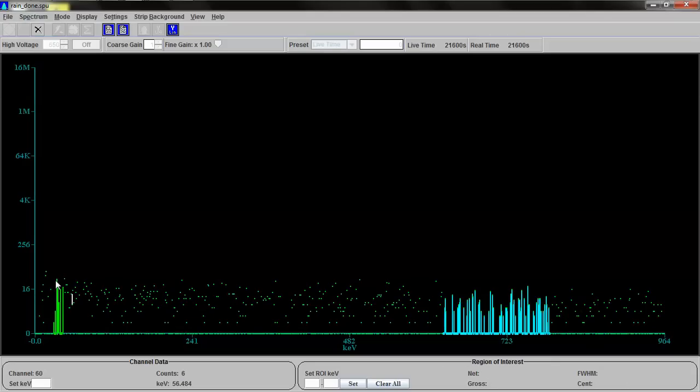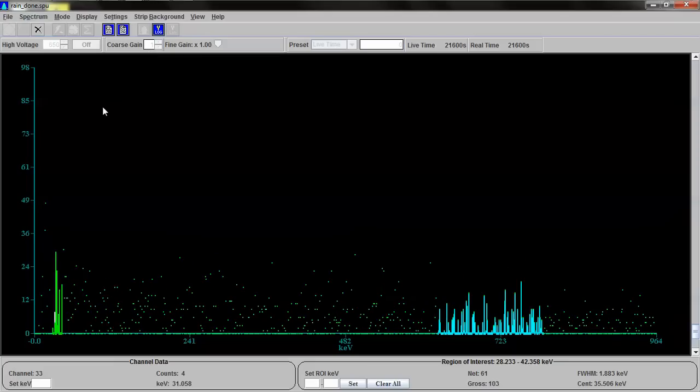And as you can see, there's a little bit of a rise right at 32. It's not much. Let's go to linear and take a look. See what I mean? It's not much at all, but there's a little bit of a rise. Could be something. Let's see, where's 662? That's 696. 670. Where is it? There. It's not particularly apparent.